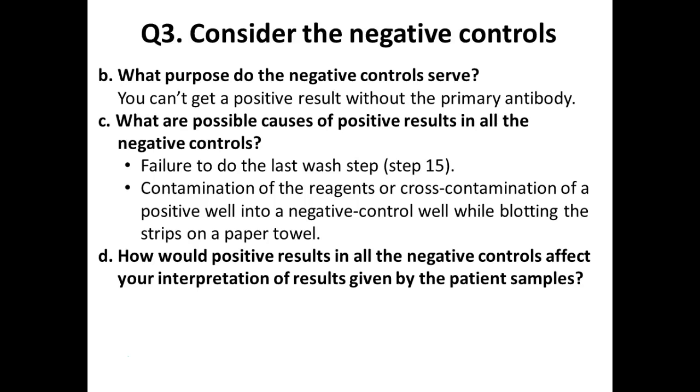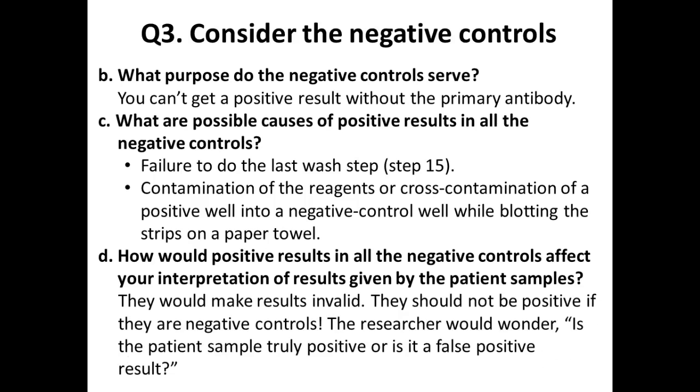How would positive results in all the negative controls affect your interpretation of the results given by the patient samples? It makes them invalid, right? Negative should be negative. If negative is positive, something went wrong. You don't know what went wrong, right? So you can't assume anything about that patient sample. You'd have to repeat the test.